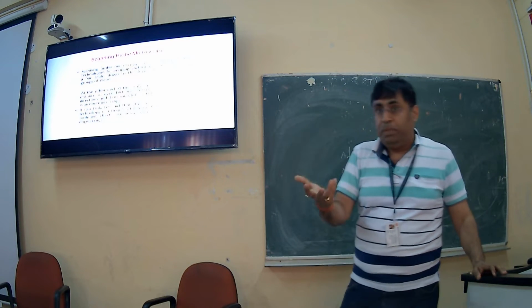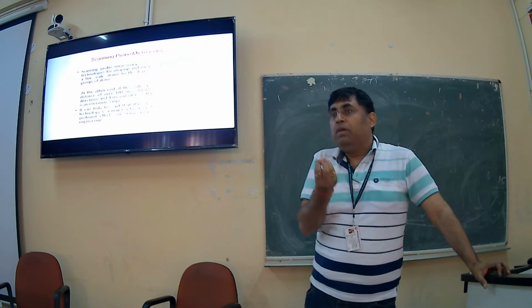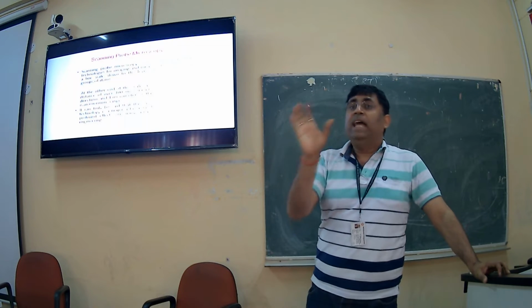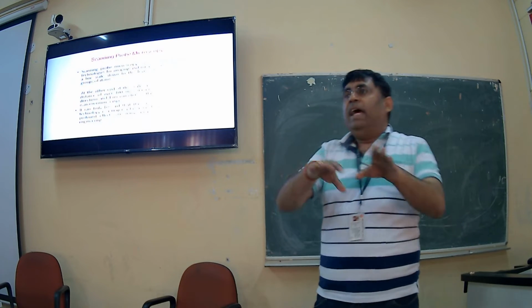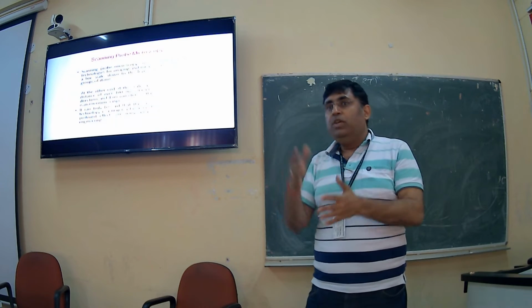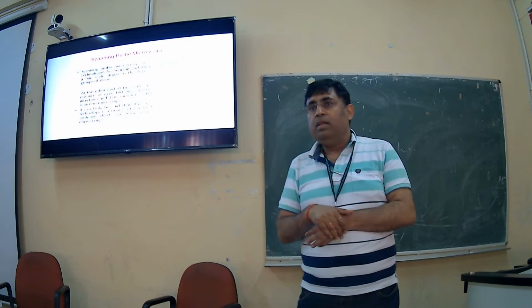Here it's spectroscopy, because you will count how much intensity of the fluorescence there is, how much fluctuation a particular fluorescent molecule is making. You count that, then correlate it with another, and using some formula, you will create an XY axis graph, and accordingly you will know the concentration as well as the, what was the second one?